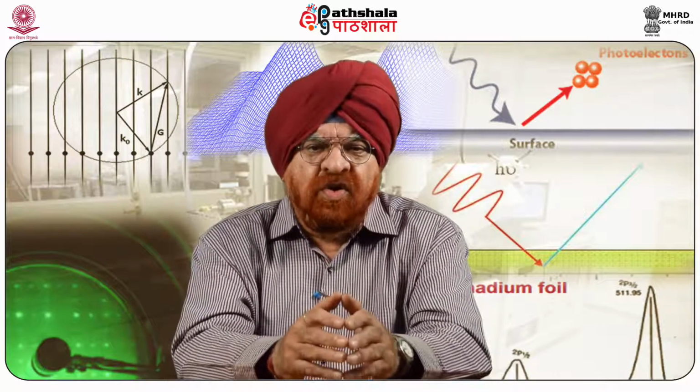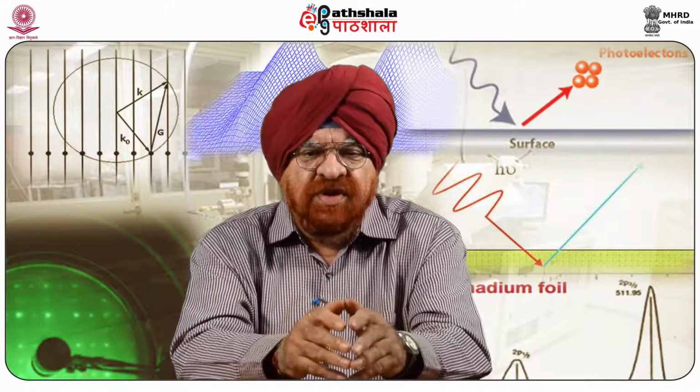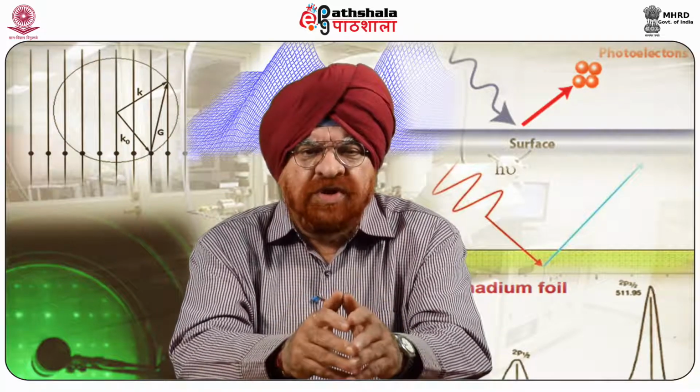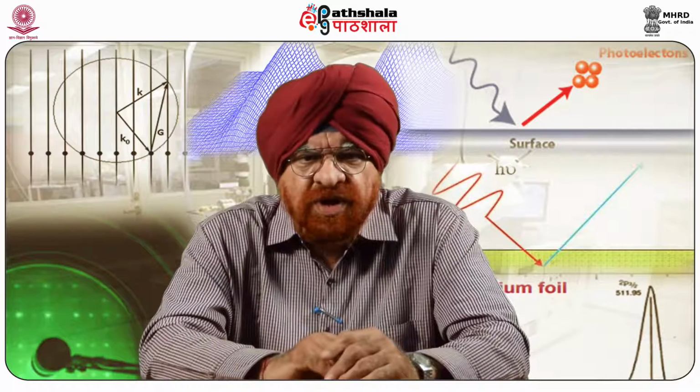In non-contact mode, the cantilever oscillates close to its resonant frequency at a small distance, 1 to 10 nanometers above the surface, and long-range attractive forces induce changes in the amplitude, frequency, and phase of the cantilever.